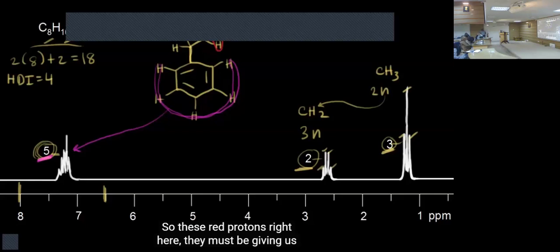Hani, you need to just consider that in the previous example, here also we are just looking at the simplest example. These are all n+1 rule. There is no complicated signal like doublet of a doublet or triplet of a doublet or doublet of a triplet, whatever. There are no such kind of complicated signals. These are the most simple, easiest NMR.